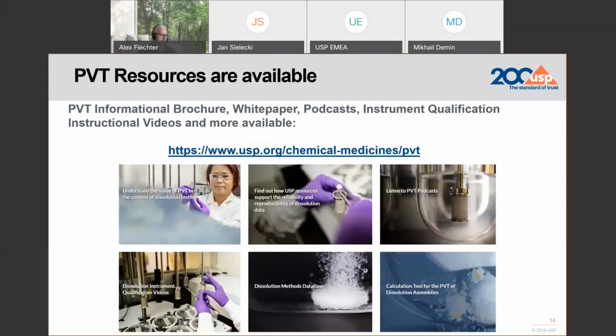Just before I dive a little bit more into detail with the PVT itself, you can find lots of resources on our website as well. Lots of videos, lots of descriptions. We have a toolkit there that not only describes the essentials of the PVT, but the dissolution tests in general. We show you how to effectively degas the medium if your drug formulation requires the medium to be degassed before you put the formulation into the media.